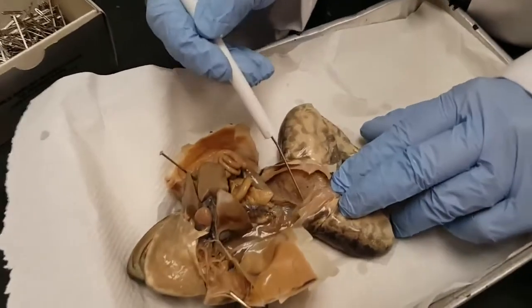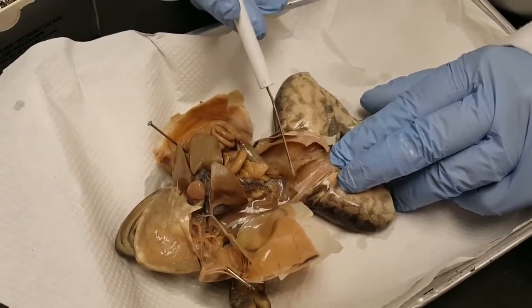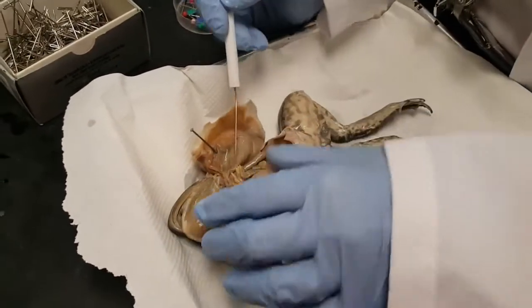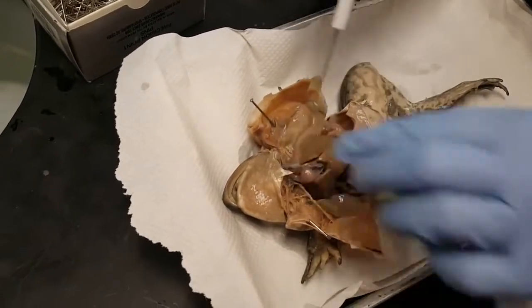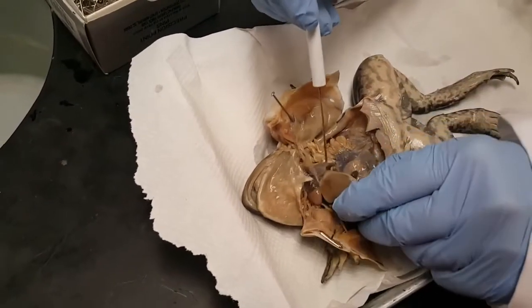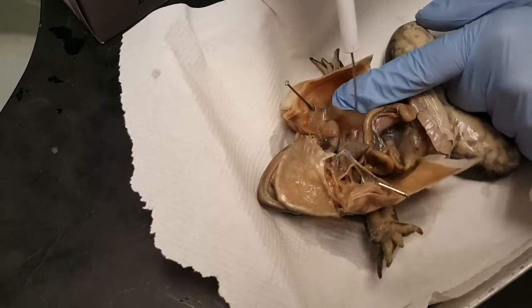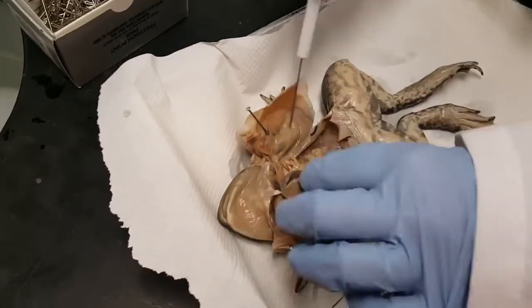Down here at the bottom of the frog you have this kind of flappy structure — it's usually deflated, kind of like a balloon — and this is the urinary bladder. And if we pull all the way back here, we find some spongy structures which are the lungs. There's a lung on that side, kind of close to the heart, and a lung on this side, close to the heart. And that's pretty much all that's in the frog.